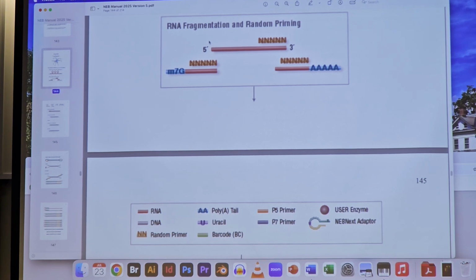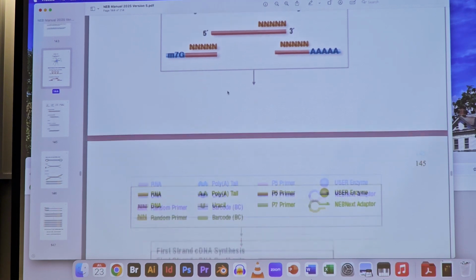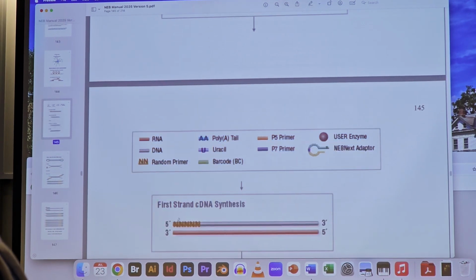So just take this sequence here, and we're going to copy the first strand cDNA in that direction, 5 to 3. So this will be the 5' end, that'll be the 3' end. And now we're just going to turn the whole thing around in space. So we're just going to rotate it this way, okay? And if we rotate it that way, then the 5' end with our ends is now over here. Here's our cDNA, 5' to 3' that way.